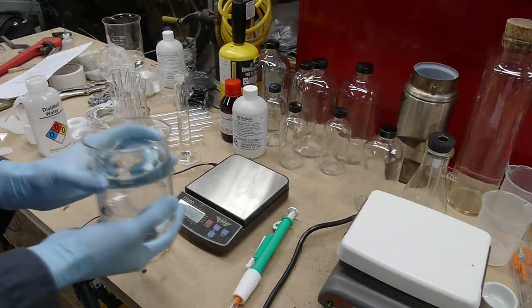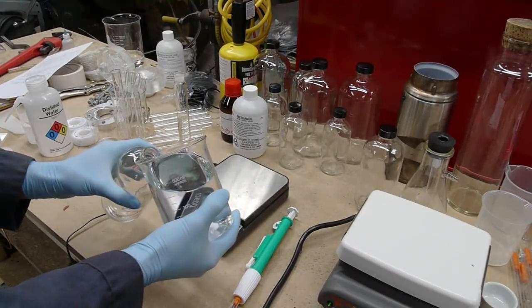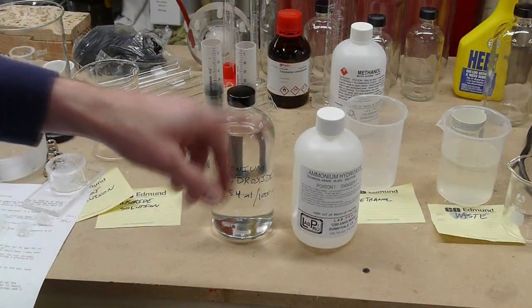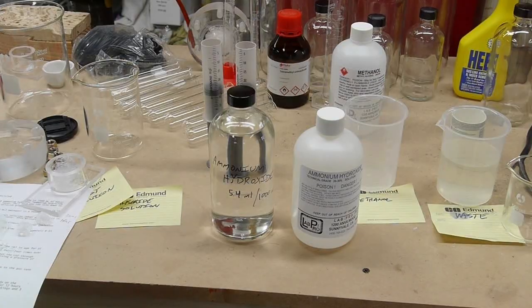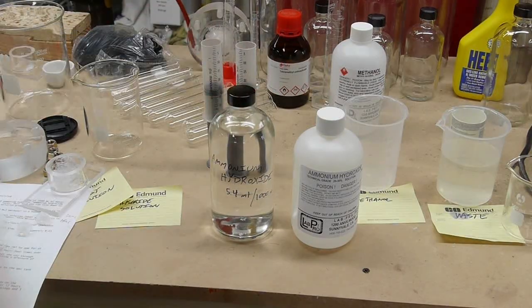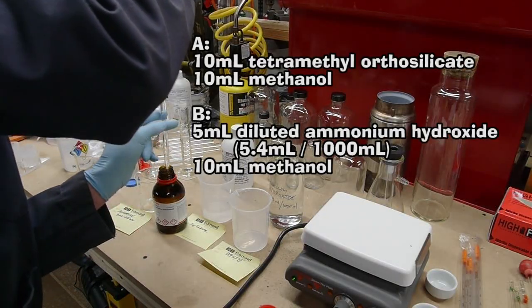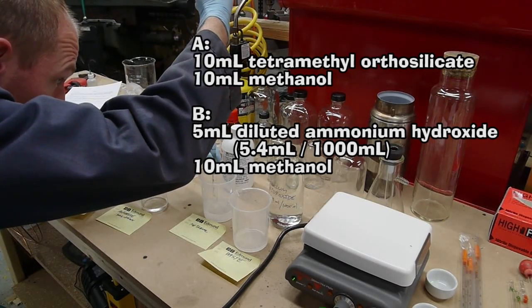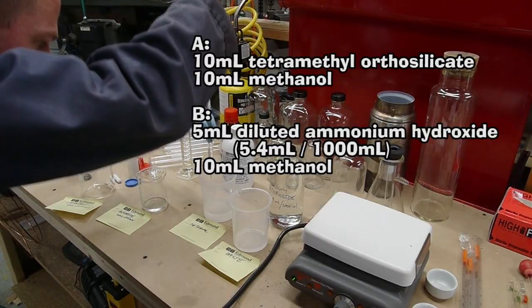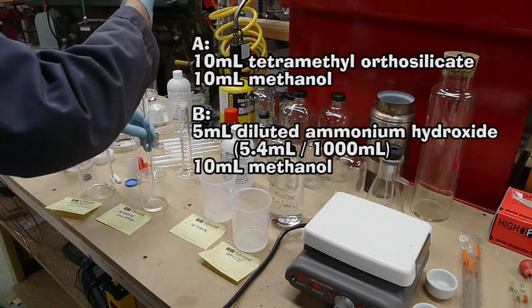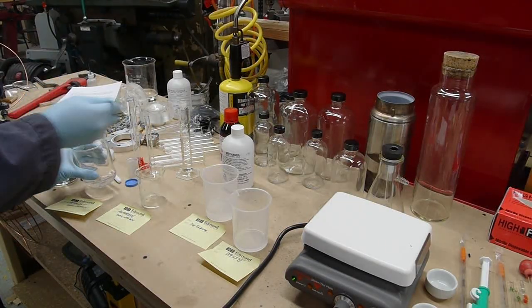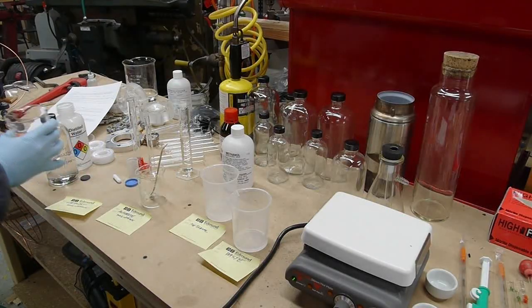So I made up a stock solution of this ammonium hydroxide and I didn't have a volumetric flask, so I actually measured the water out by mass. And then used a pipette to measure the ammonium hydroxide. Okay, so after I had the stock solution of ammonium hydroxide, I mixed up the solution A on the instructions here, which is a combination of the tetramethyl orthosilicate and methanol. And then solution B, which is a combination of this ammonium hydroxide stock solution and methanol. Then you mix solution A and solution B together and pour this mixture into a mold.